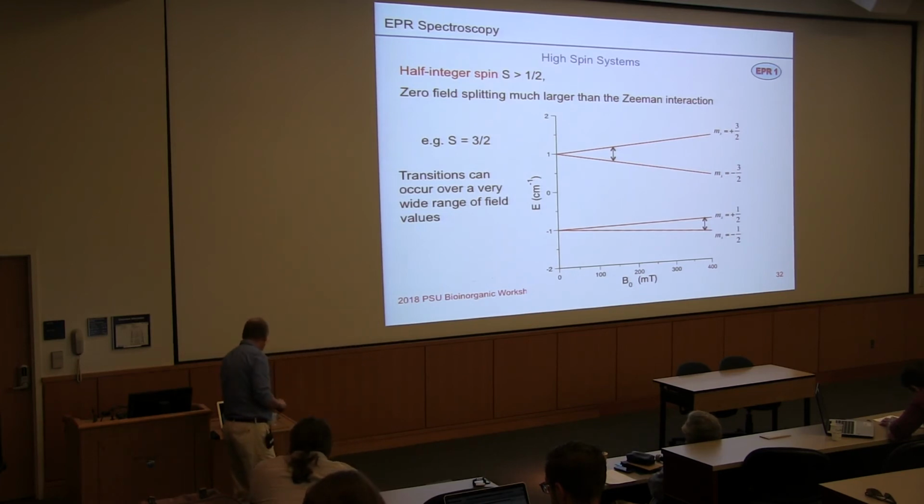The situation is even more extreme. Well, actually, I should point out here that in EPR1, again, you'll be looking at a high spin system and seeing this effect.